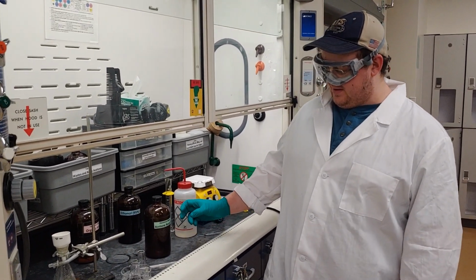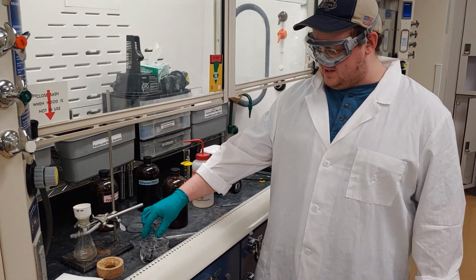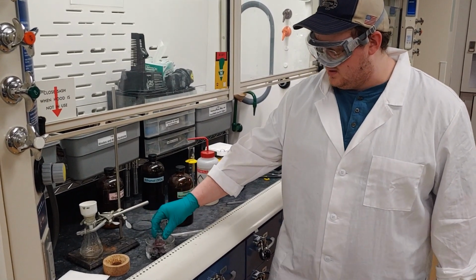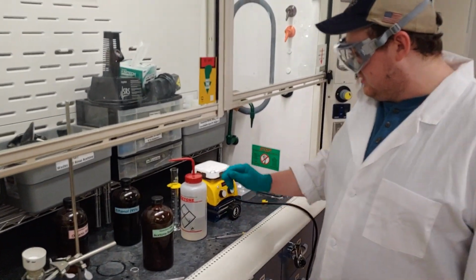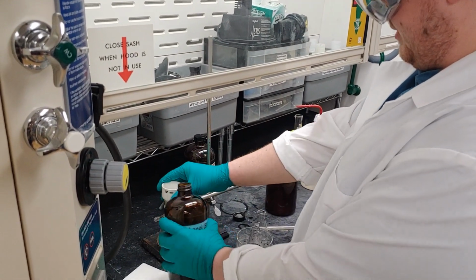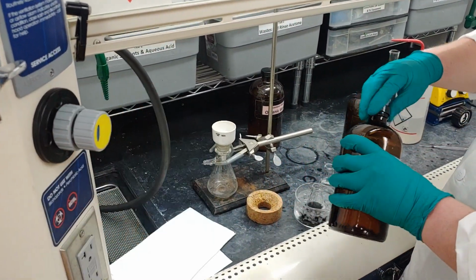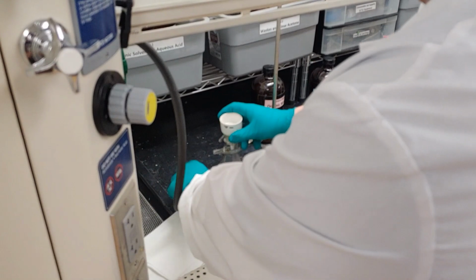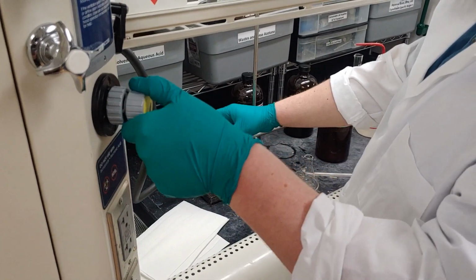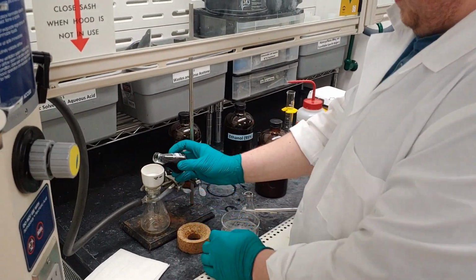So now after I have let my product sit at room temperature for about 10 minutes, I've let it sit in the ice bath for about 20 minutes, which should have solidified most of the product. Now what I'm going to do is filter it. So first thing to do is wet it with a tiny bit of ethanol, and pull suction on that. And then I will pour my product into the funnel.